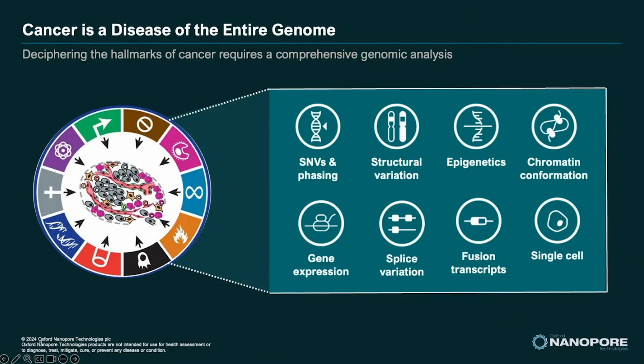And so being able to comprehensively view and probe both single nucleotide variants with phasing or fusion transcripts or gene expression on a single platform, we really believe will be crucial for the community at large to continue to do important studies to advance the oncology field forward, important studies like the work Dr. Kim's going to speak about today.